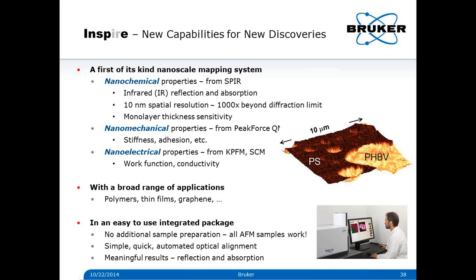But on the other hand, if it's something that is highly reflective and the surrounding polymer material doesn't show much in this region, like a resonance, for example. So if the background signal from your polymer is small, then you have a high chance that you can use the system with your special sample, but it depends on the details.